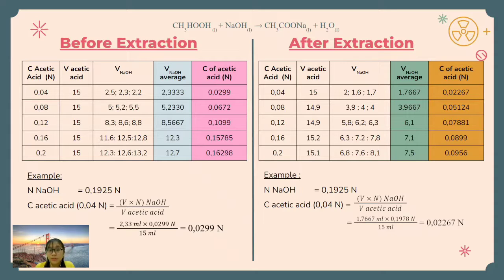The next step is to separate with liquid-liquid extraction between water and ethyl ether as a solvent using acetic acid as a solute. The thing that needs to be done is to add acetic acid solution in a separating funnel with 50 ml of ethyl ether and then shuffle it in a rolling motion until it reaches equilibrium, which is characterized by the formation of 2 layers. Shuffling was done so that the acetic acid can be completely dispersed in each solvent. When 2 layers are formed, the bottom layer will be taken because it consists of acetic acid and water.